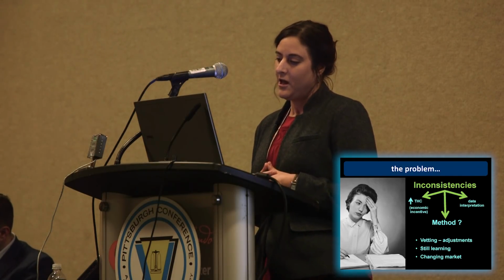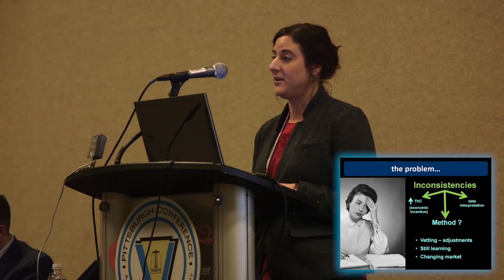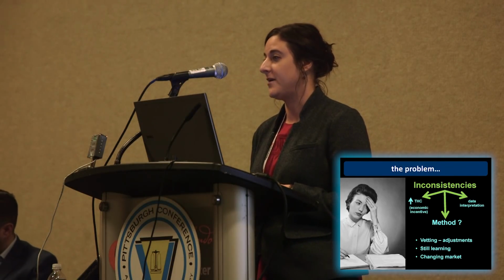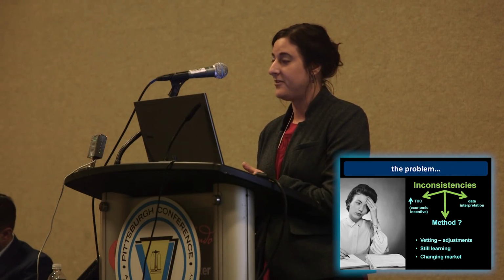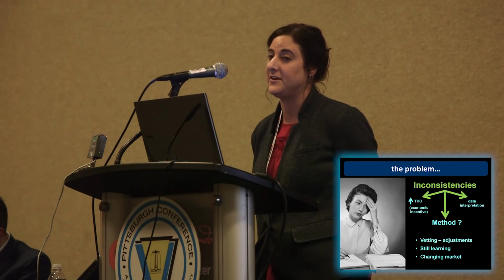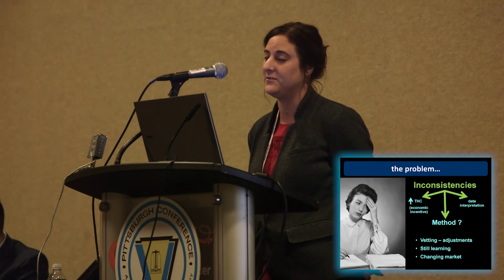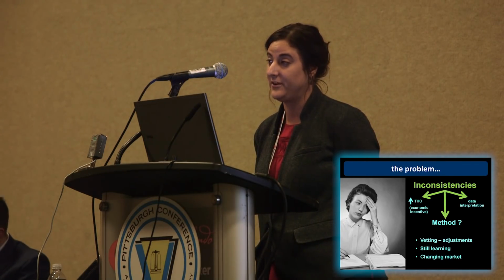And then what it comes down to is, the methods that have been developed, it's still a young industry, are they functioning how we think they're functioning? Are they the best they can really be? Anytime a method gets developed and then gets out and is used over and over by different people, and it sees different samples, you learn things. You see where maybe it's not functioning how you intended it to. And that's fine. That's analytical chemistry. So we're still definitely learning.